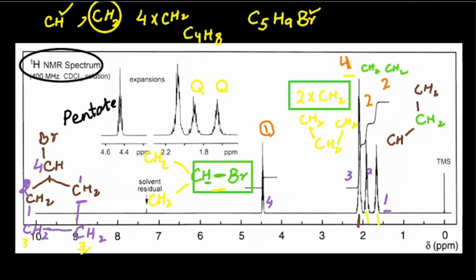That is the bromocyclopentane. But wait, here, as you may see here that this is the one kind of the proton that is directly attached with bromine. So it is chemically different. So it gives you a single peak. And these two CH2, as these both are attached with the same CHBr on one side and CH2 on other side, so these should be chemically equivalent and should give you a single peak in the proton NMR. But here, these 2 peaks we are getting.